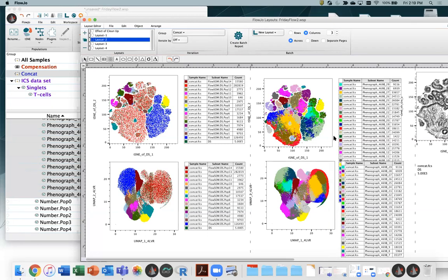So here's the option with those two. This again, Phenograph, particularly good for trying to find rare cell populations. And we can see that if anything, it overdoes finding rare cell populations. It's definitely picked out a few things that I think obviously stand out to the eye as different, that were maybe missed by FlowSOM. FlowSOM, a few more tools to dive into your data, and was definitely quicker.